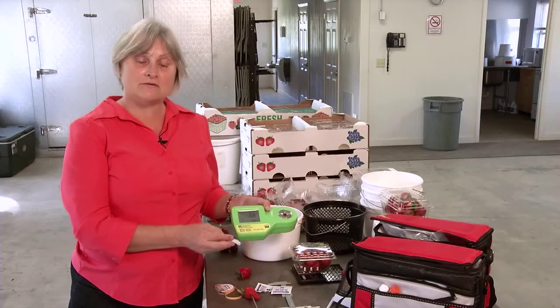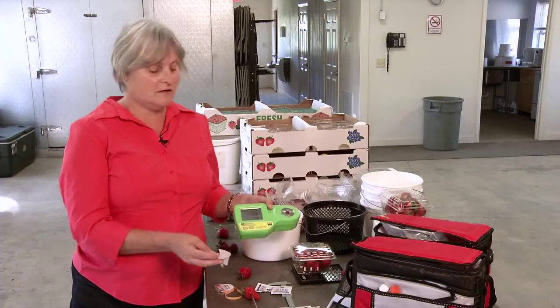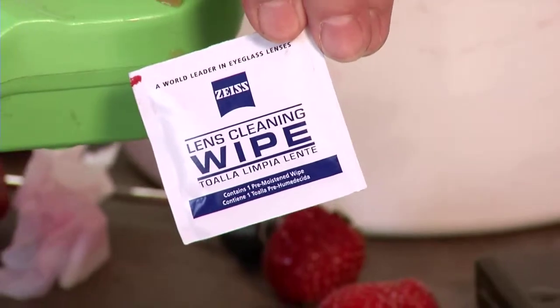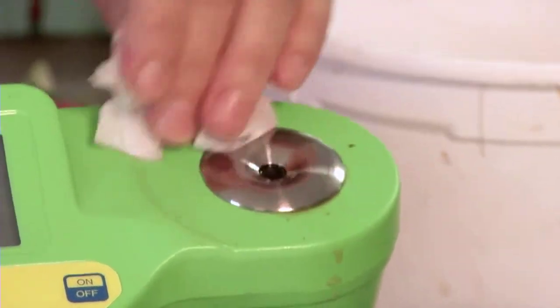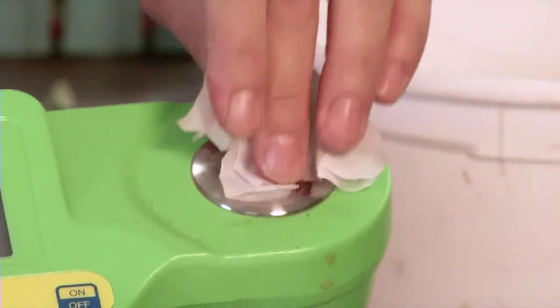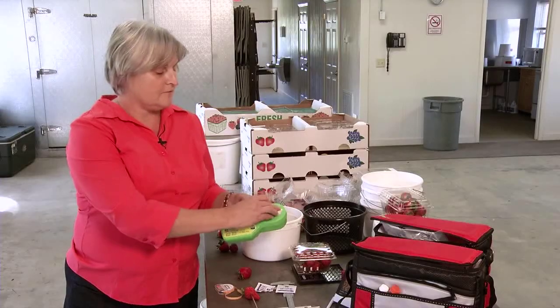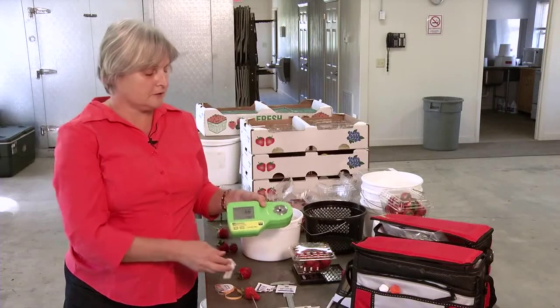When you go to clean these, you can't use a paper towel. You have to use the same thing you would use on your eyeglasses. These lens wipes can be bought just about anywhere — a discount store, a pharmacy — and you simply wipe off your lens. This lens has a special coating on it, just like your glasses do, and you want to keep it clean and not sticky. If you leave juice on here for any length of time, it's going to corrode the coating and you won't get a good reading. So this is my most expensive part of this kit.